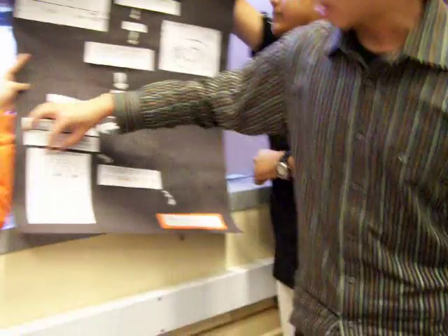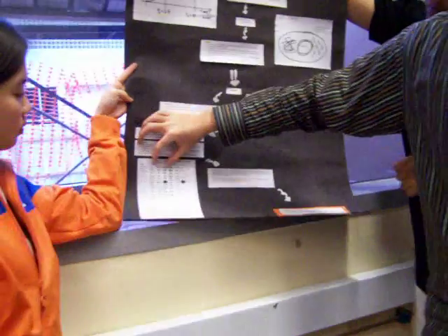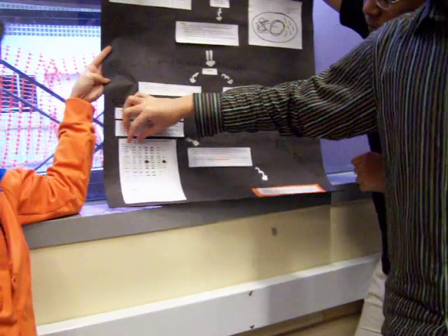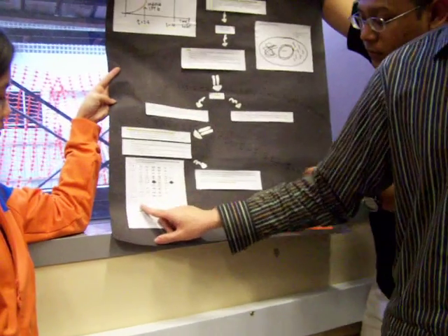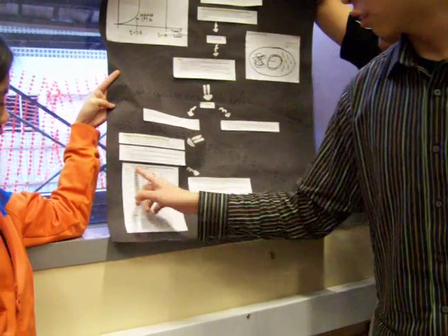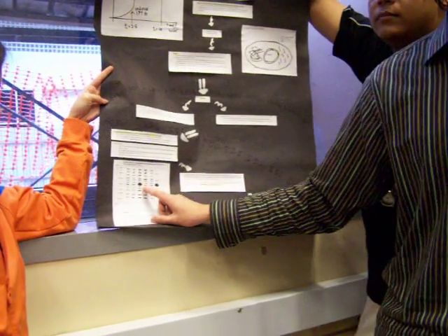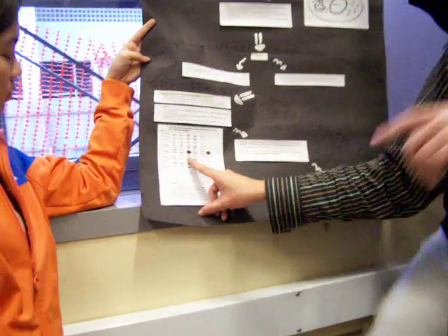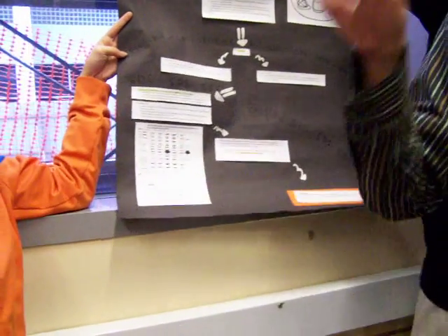As you all can see, lane 2 and lane 4 are the experiment samples. This is the time equals 2 hours, and this is at time equals 10. The difference you all can see is there's a big thick band here. This is our fat protein.